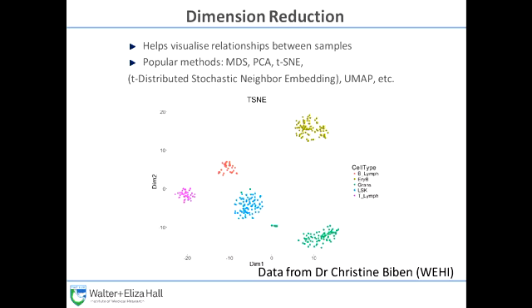And so here, we typically have, after QC, perhaps 10,000 to 15,000 gene expression values present for each cell that we've assayed. And so we can't look at that data and make sense of it. Can't open Excel and eyeball that data to get a feel for what's going on.